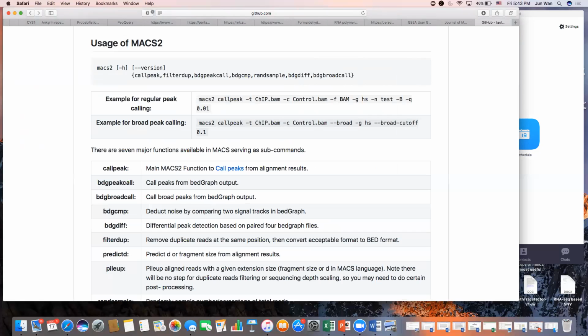It's just for installing, we started with python space -m space pip, and then we follow the command. So it'd be python space -m space pip install MACS2. Yes, exactly. That might help. Stacy, try that, would you? Can you repeat that? Python space -m space pip install MACS2. Make sure MACS is capital. Travis, give it a shot. It gives the permission stuff. Yeah, it's an OS error. We don't have access to the site packages directly. Talk to your sysadmin and see if you can get your IT guy. If not, we'll talk amongst ourselves and see what we can solve for you as well.